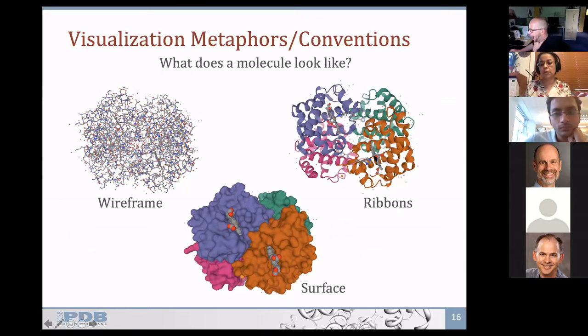And so it appears that these ligands are floating in space, which is not true. If you add back the side chains and look at the surface, you will see that the ligands are snugly fit in different pockets on all 4 chains.